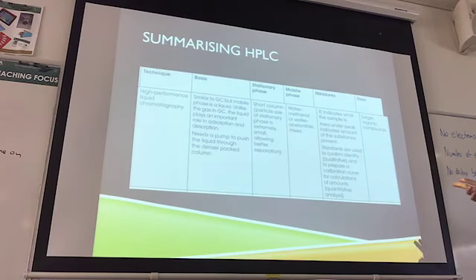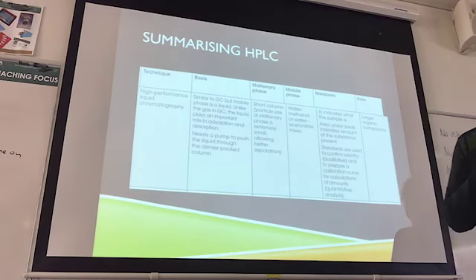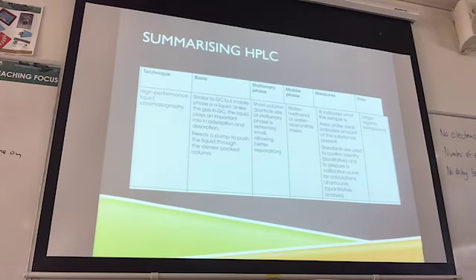You have a short column with a particular particle size, and it's extremely small, which allows better separation because you want to be able to really separate out the different substances. You don't want them coming out at similar times. You want clear separation of them. The mobile phase could be water or methanol, or a water methanol mix, or water acetone or acetonitrile mixes. So there's a variety of different solvents that can be used there.